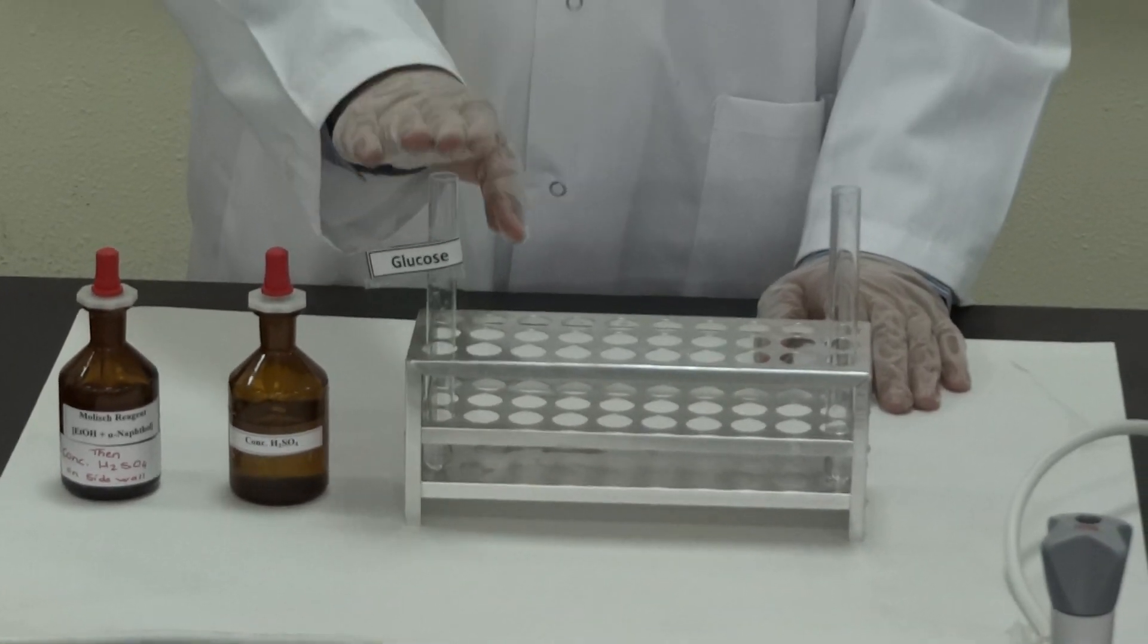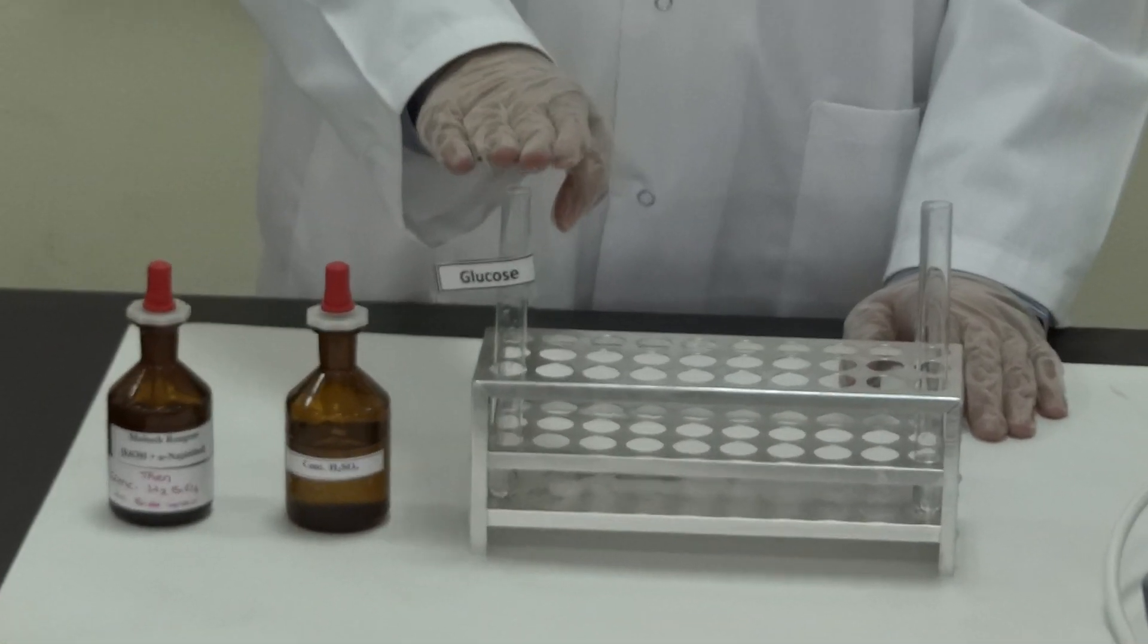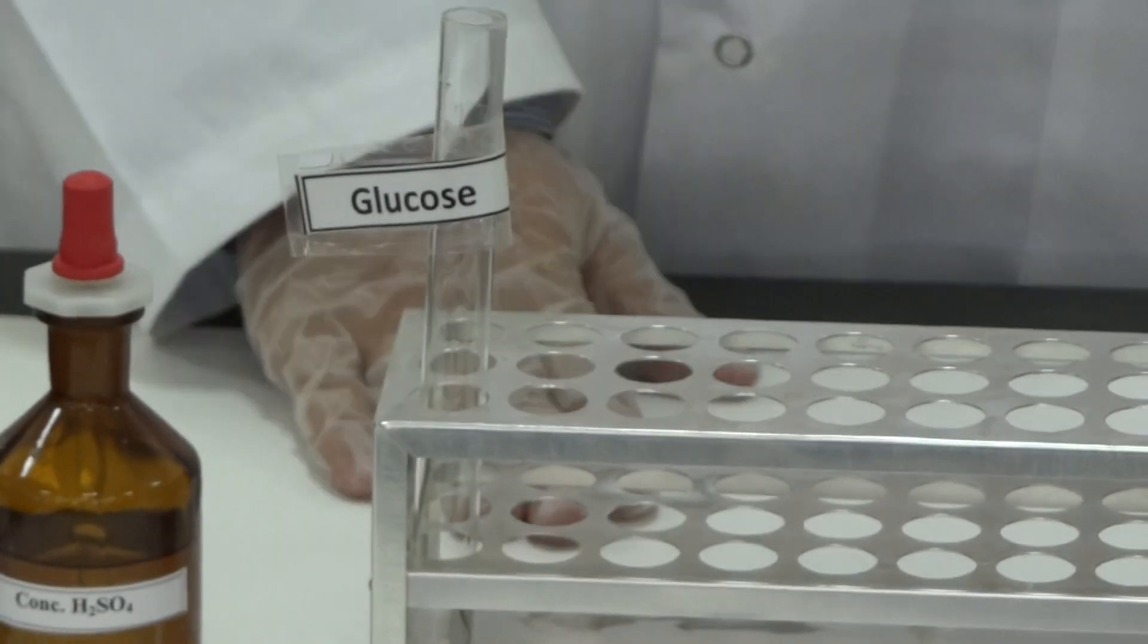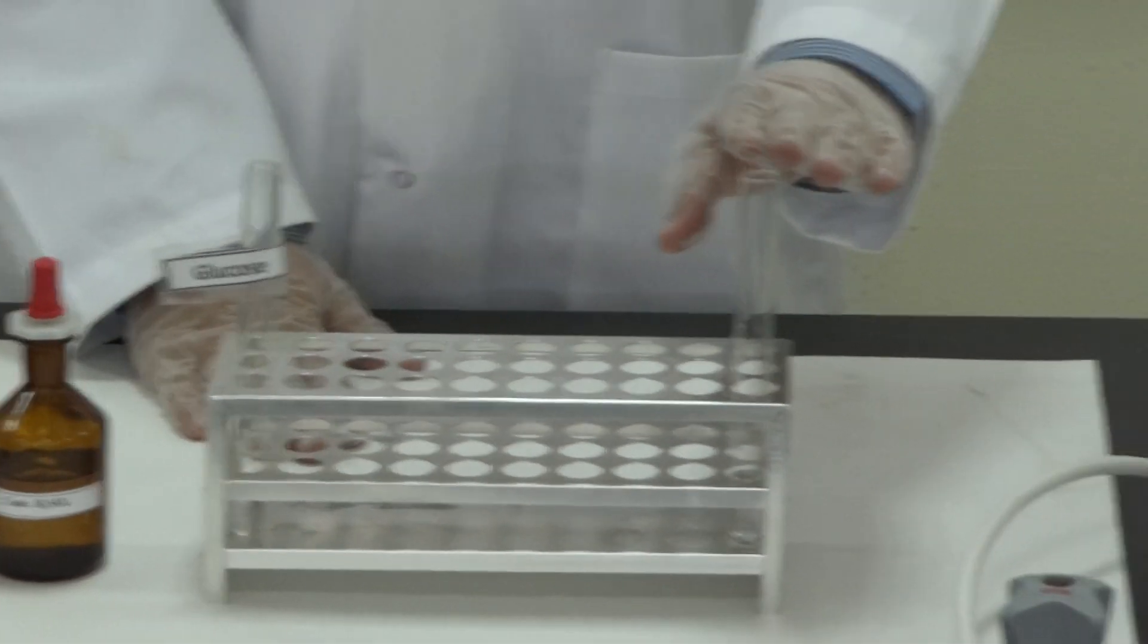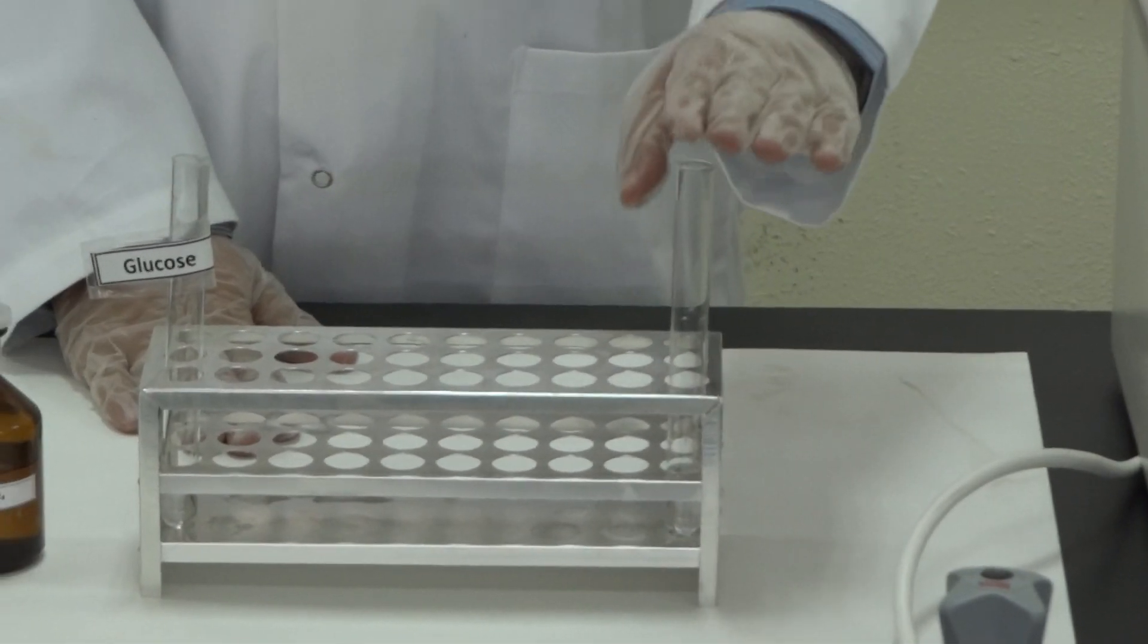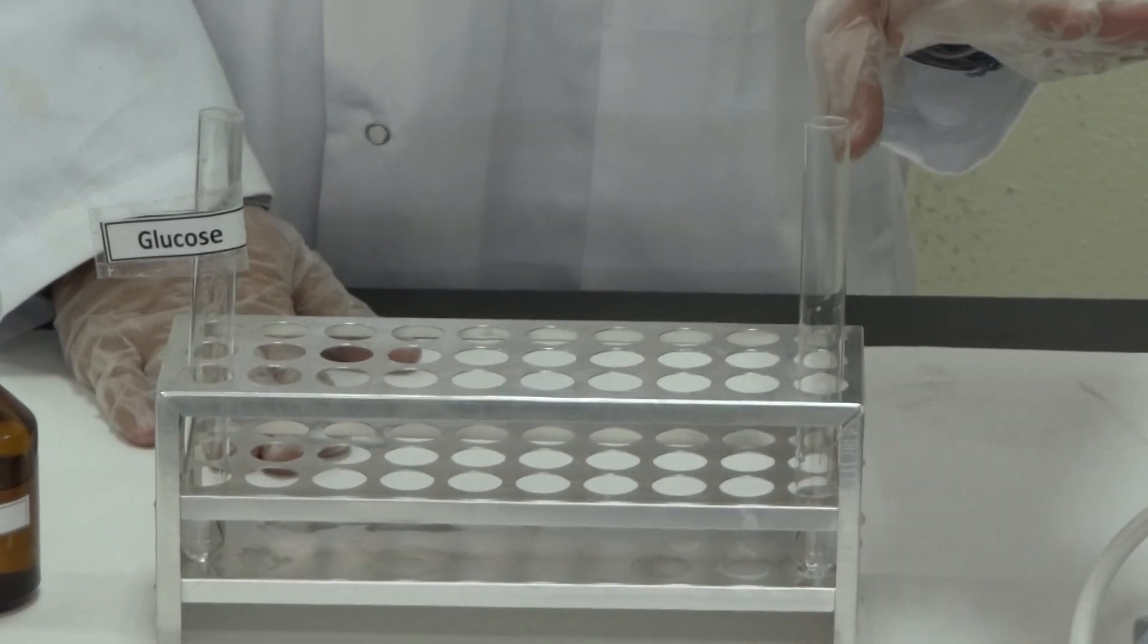Here, this is a carbohydrate, for example, these liquids, monosaccharides. And here, is an agent. Could be proteins, amino acids, even could be water, something not carbohydrate.